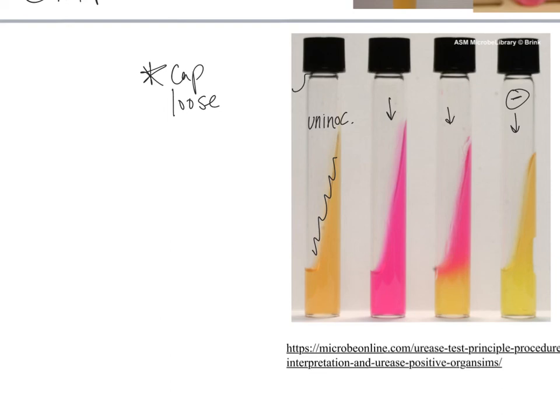Okay. So it's a lot of tests to keep straight. You'll want to keep going over it just so it gets a little bit more familiar. The good news is we only have 2 more tests to inoculate, and then you'll be able to discern between all 10 of those gram negatives.